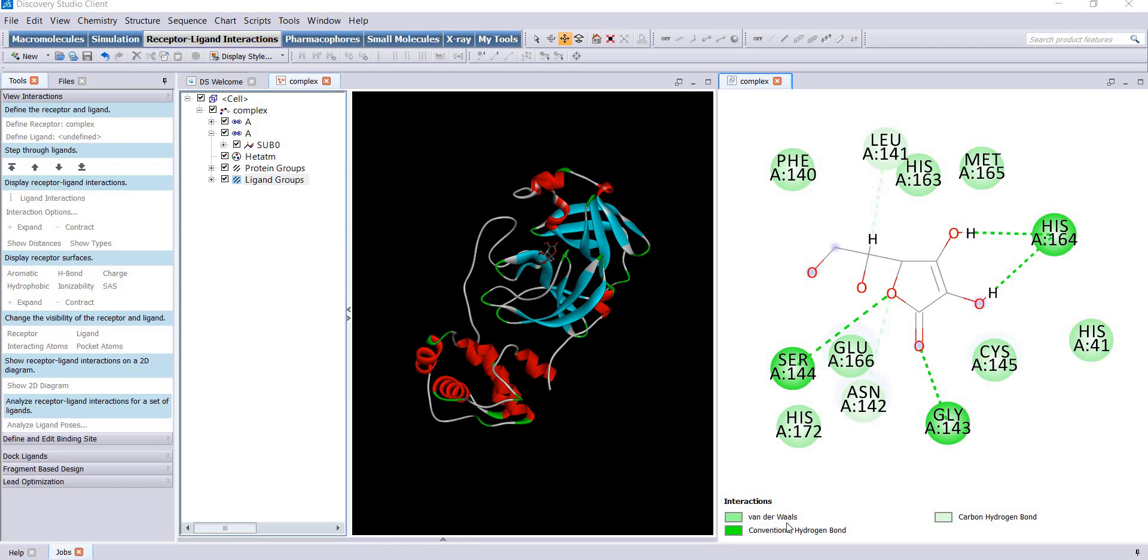In short, all these residues are forming the active site of this protein where your ligand is bound. If you are interested in the actual pose visualization, you can scroll through this window and see the amino acids in this panel.